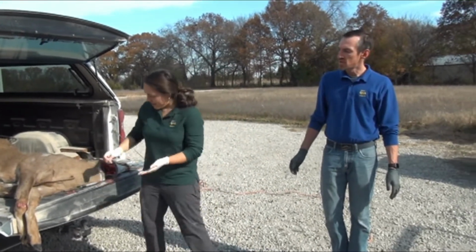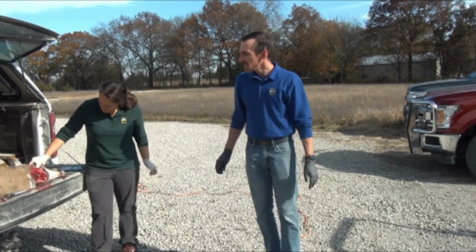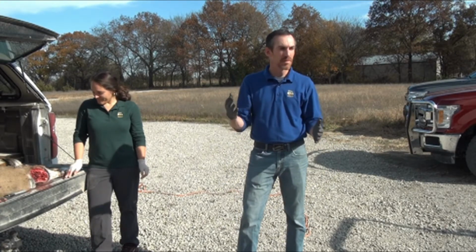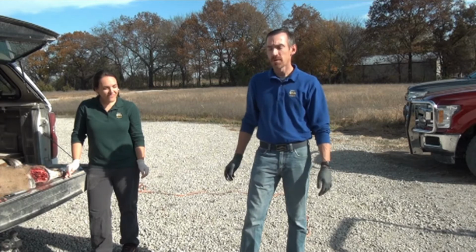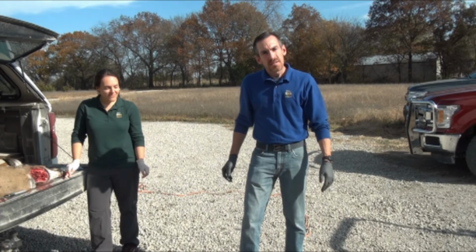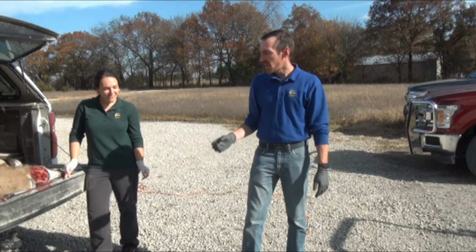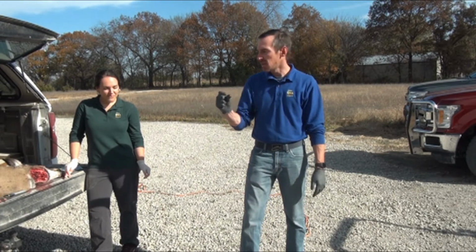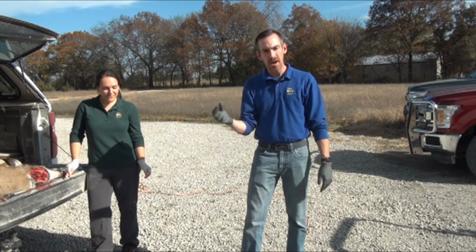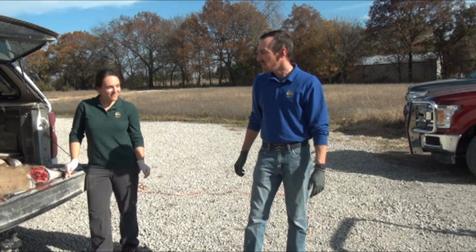So Dr. Rudin mentioned briefly the size of the retropharyngeal lymph nodes. There's really no pattern necessarily. Some folks might think the lymph nodes are a little bit bigger in a buck or a little bit smaller in the doe, and that's generally true, but not always. I think this animal is a really good example: obviously we have an adult buck here that has two fairly small lymph nodes, and so size isn't always a great reference. Again, you're feeling around for that solid ball of tissue in there.